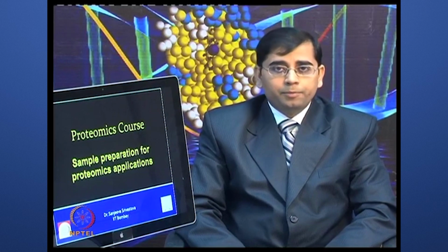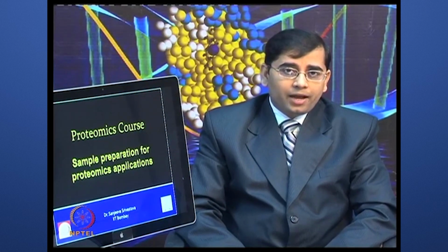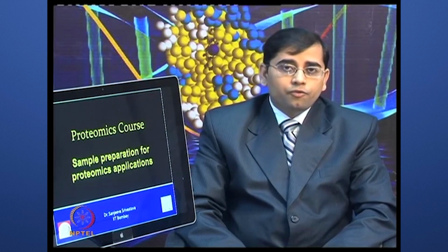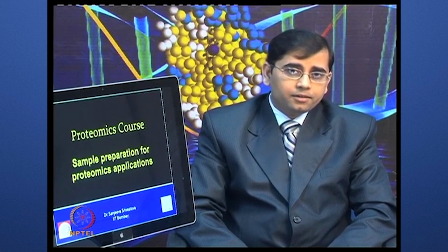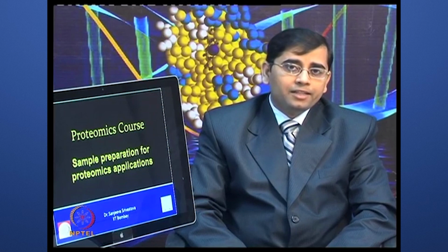An ideal sample preparation step ensures that you have no contamination, you have very good protein yield, and no interfering substances are present in your extract.